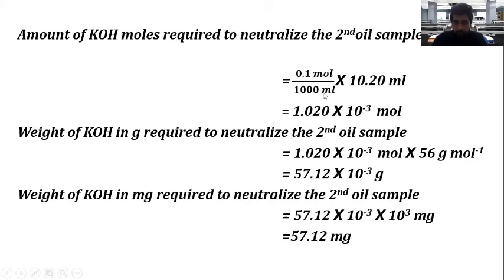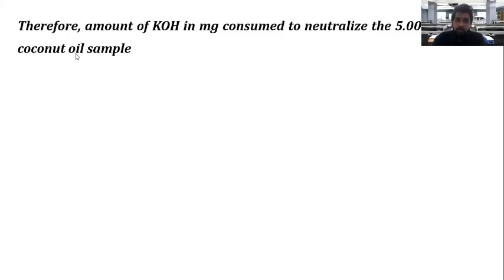Then therefore the amount of KOH in milligrams consumed to neutralize 5.0010 grams of the coconut oil sample.